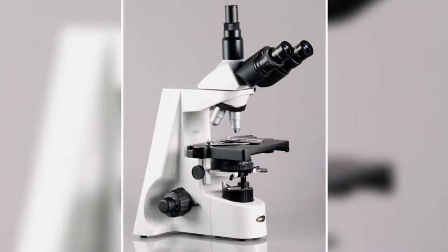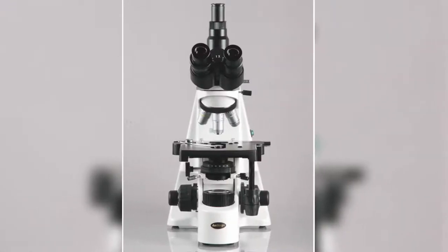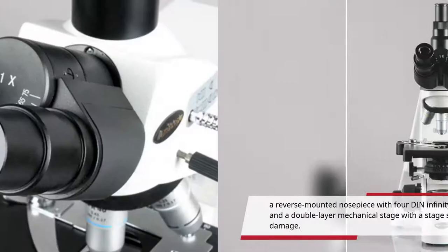The AmScope T690C 5M Digital Compound Trinocular Microscope has a Siedentopf binocular mount with interchangeable pairs of 10x Super Wide-Field and 25x Super Wide-Field eyepieces, a reverse-mounted nosepiece with four DIN Infinity Objectives, bright-field halogen illumination, and a double-layer mechanical stage with a stage stop to protect slides and objectives from damage.